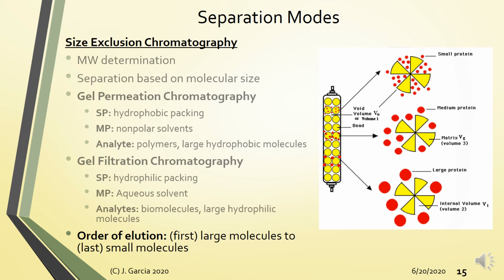Now when rating the stationary phase for SEC, you have to consider yung exclusion limit na tinatawag, and yung permeation limit. So this will guide you regarding which stationary phase to use. You need to have an initial assessment of the relative molecular weights or molecular sizes of the analytes, or the components of your sample, before choosing the appropriate stationary phase for SEC.